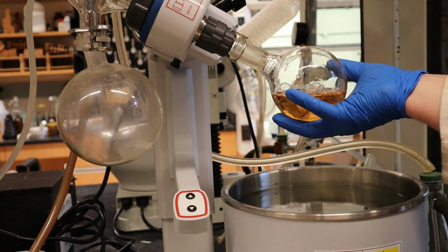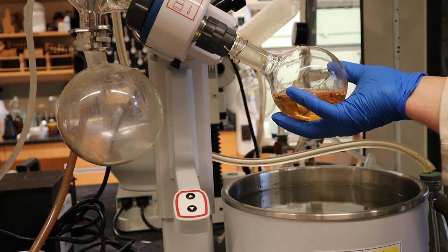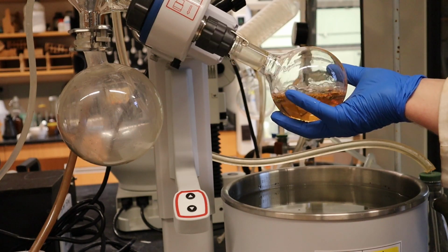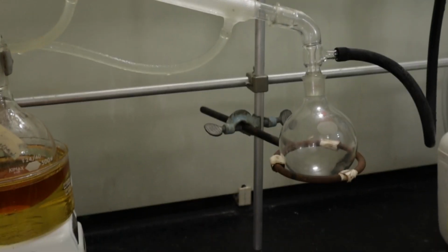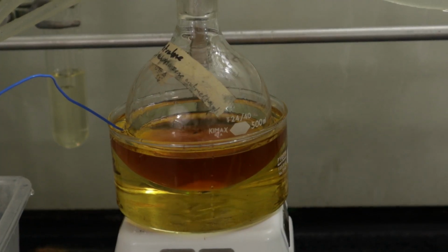The rotovap was very effective at removing DCM, but the vacuum didn't get low enough to remove all of the dichlorobenzene. To remove the dichlorobenzene, I used vacuum distillation. I attached the apparatus to the Schlenk line, which had a very good rotary vane vacuum pump. I was able to get the pressure low enough that the dichlorobenzene boiled well below 100 degrees Celsius.